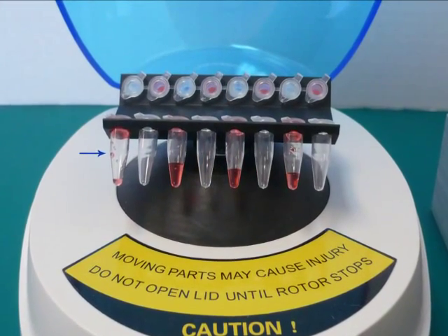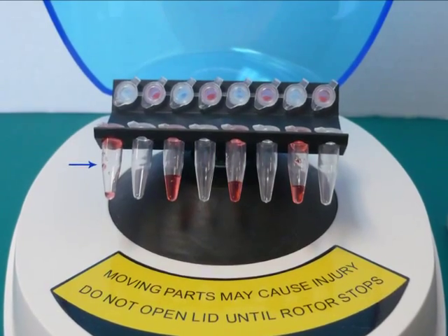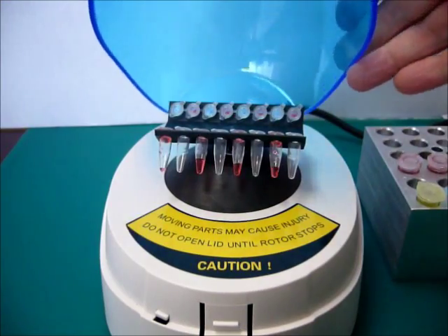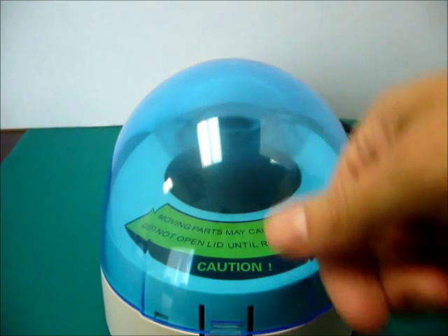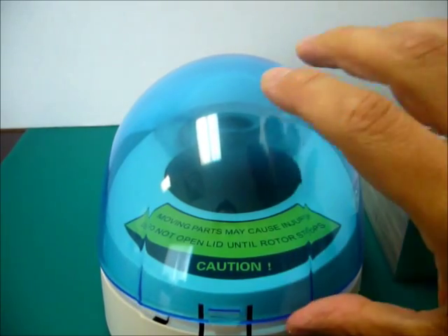Simply insert your sample tubes into the centrifuge rotor and close the lid. The unit begins to spin and produce a relative centrifugal force of 2000 times G, the ideal speed for concentrating samples to the bottom of test tubes.